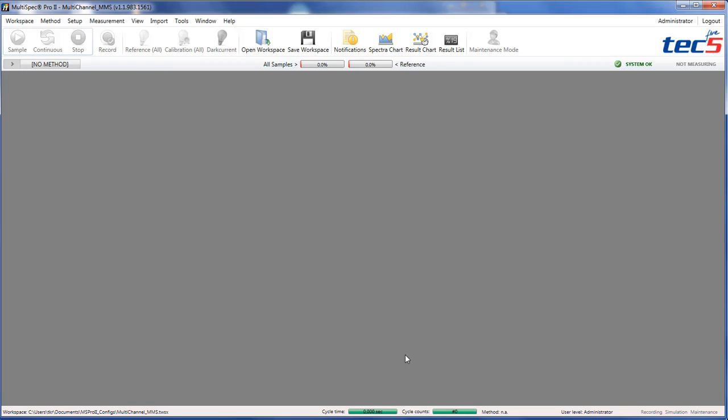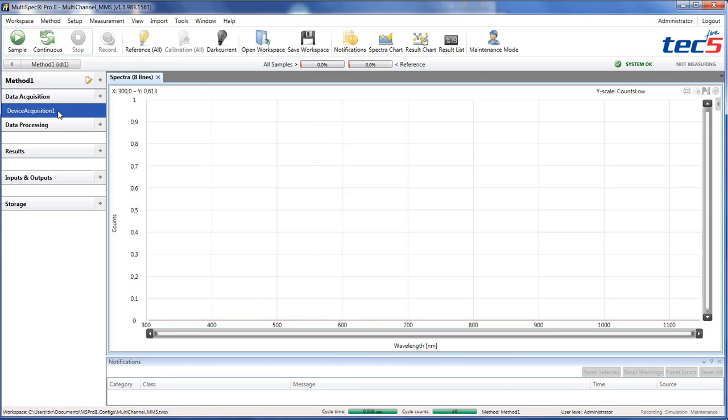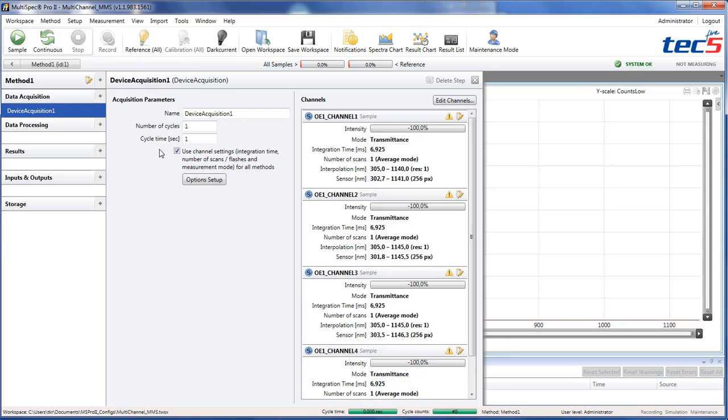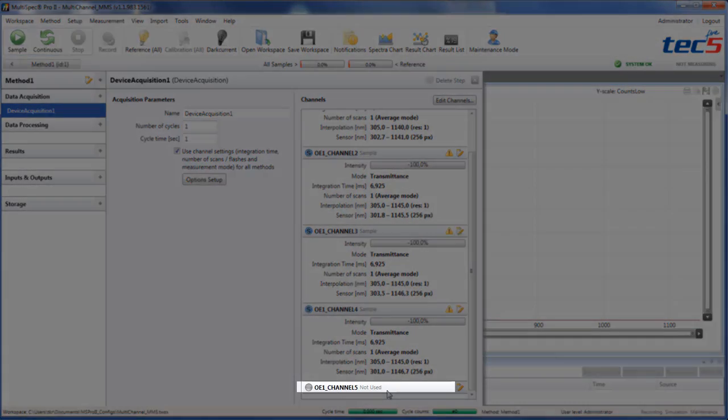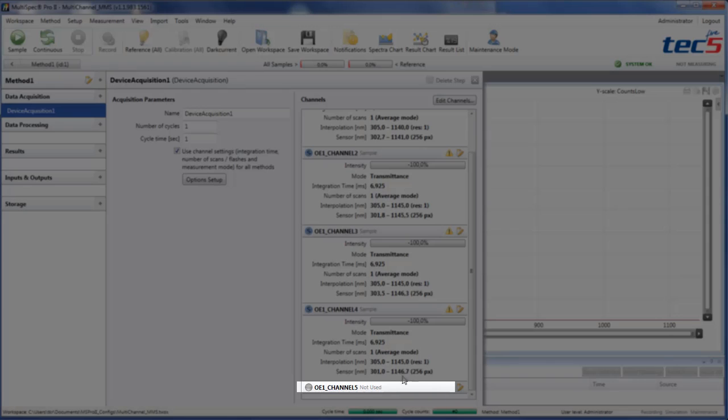Multispec Pro 2 now starts with a dark current acquisition. In the device acquisition method step, you will see that there are four channels as sample channels, and the fifth channel is not used.